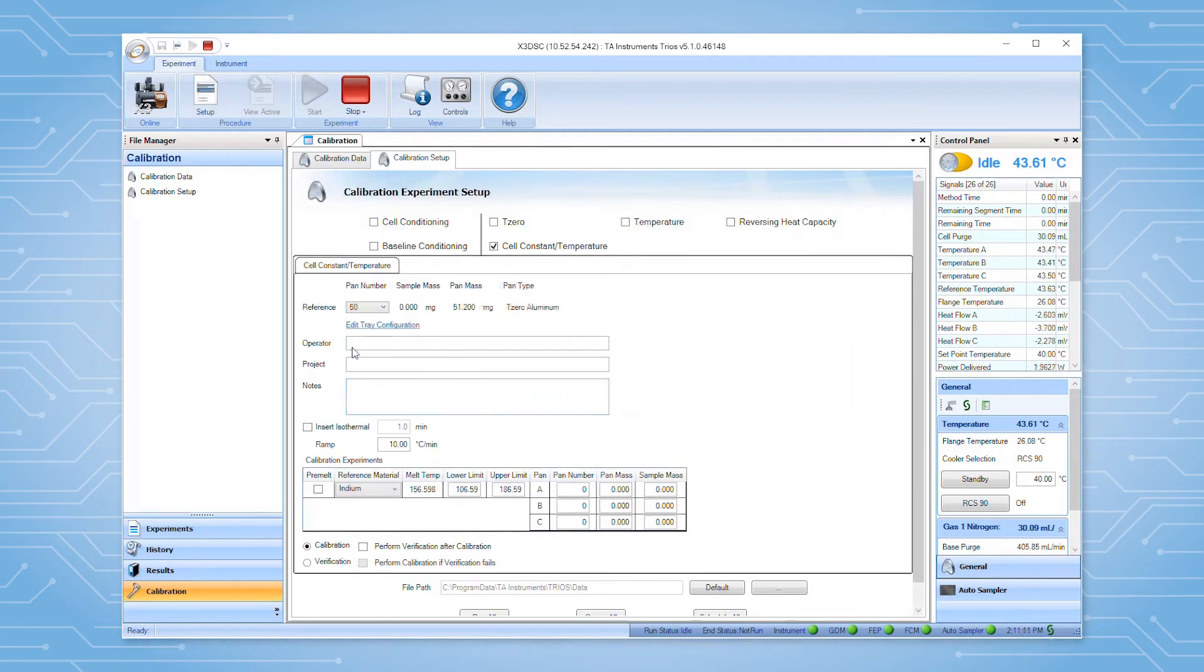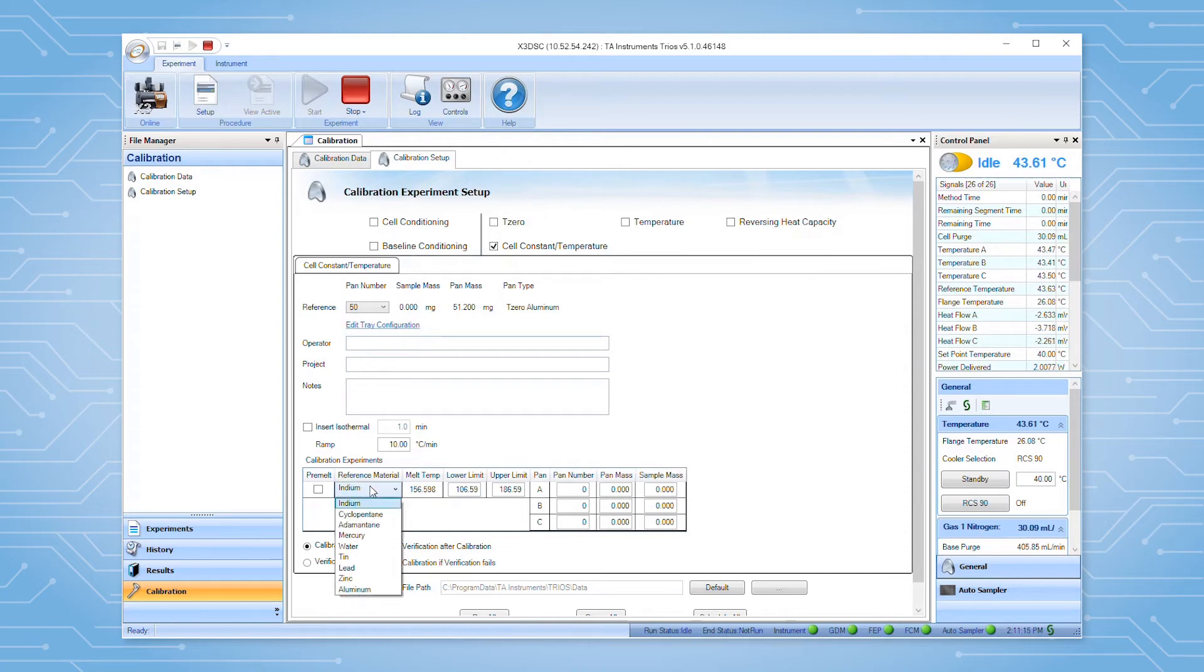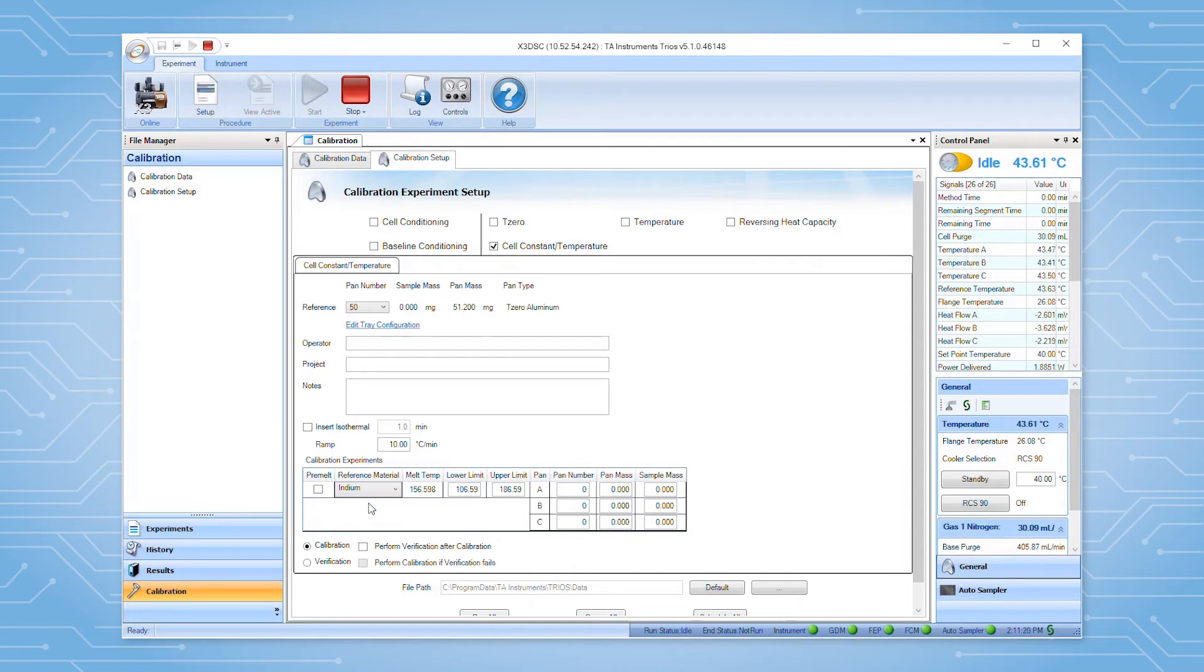Select the correct calibration reference material from the list. In this case, we'll choose indium. If new samples are used, check the pre-melt option.